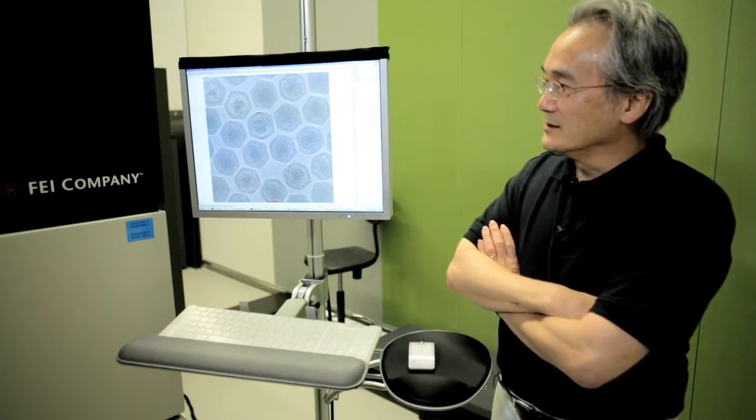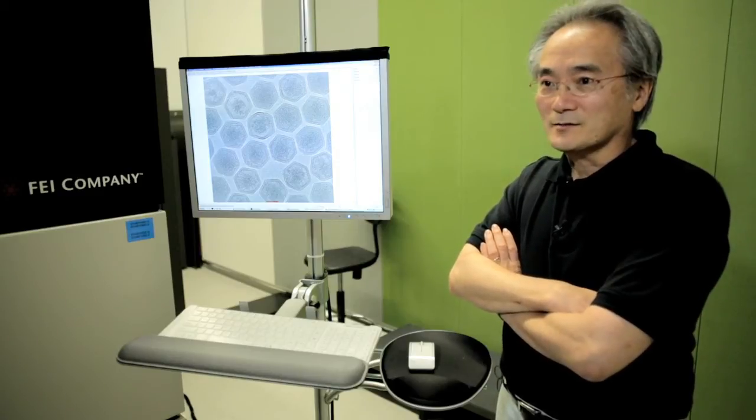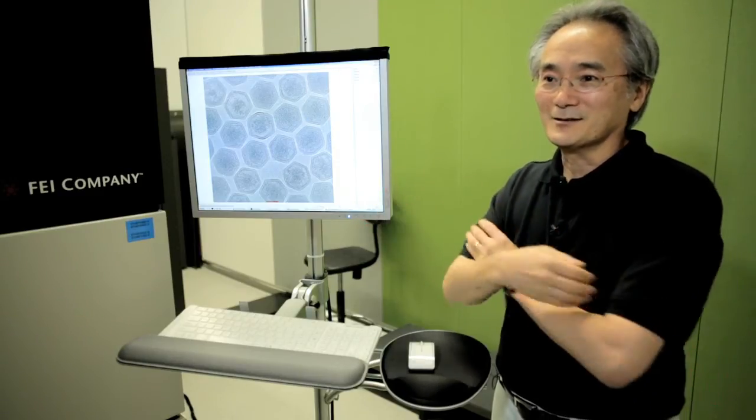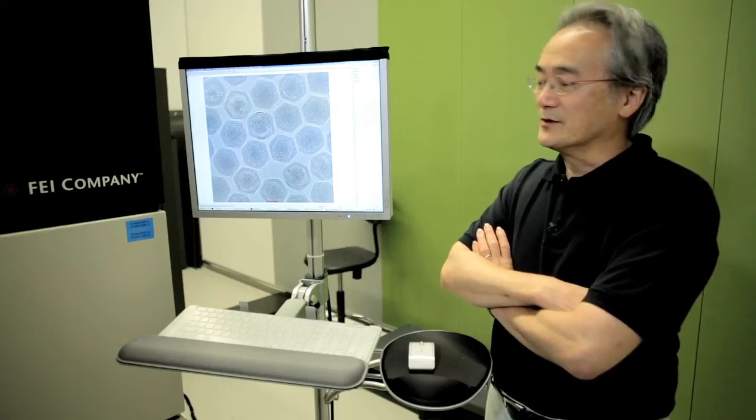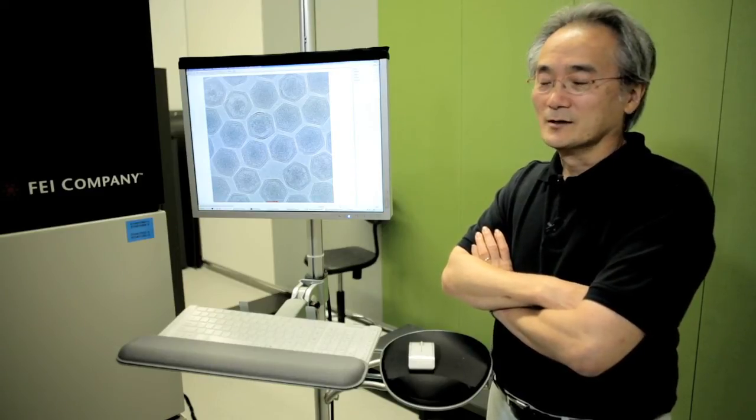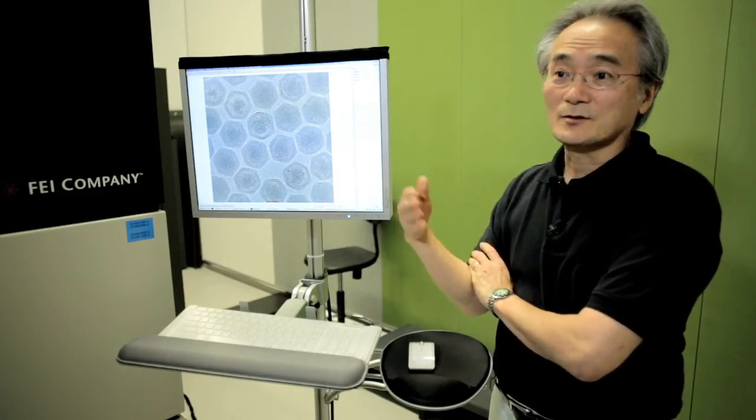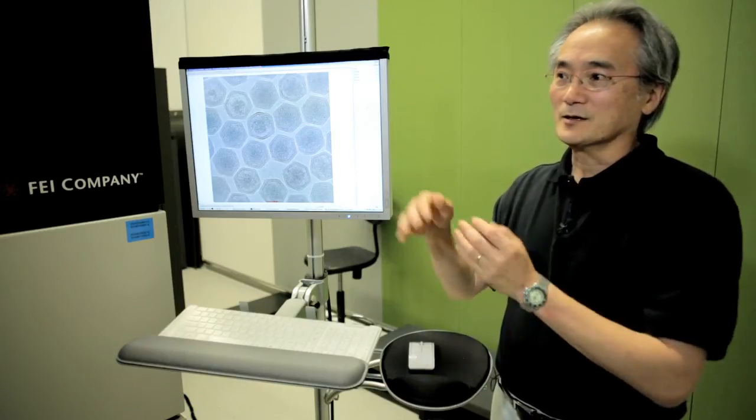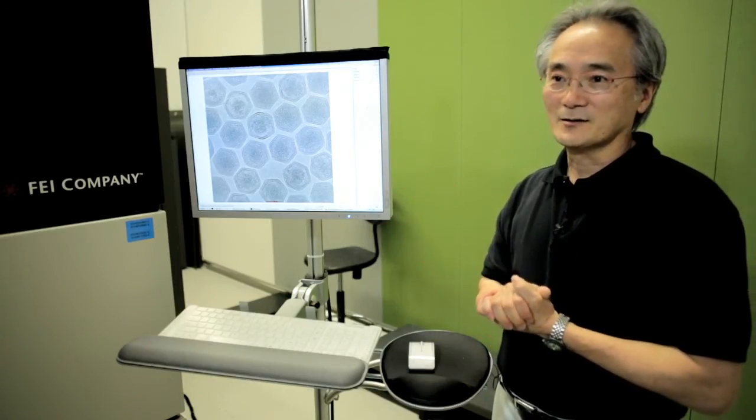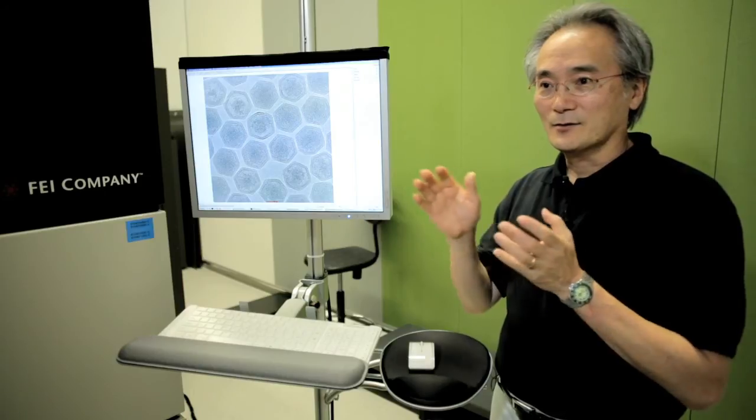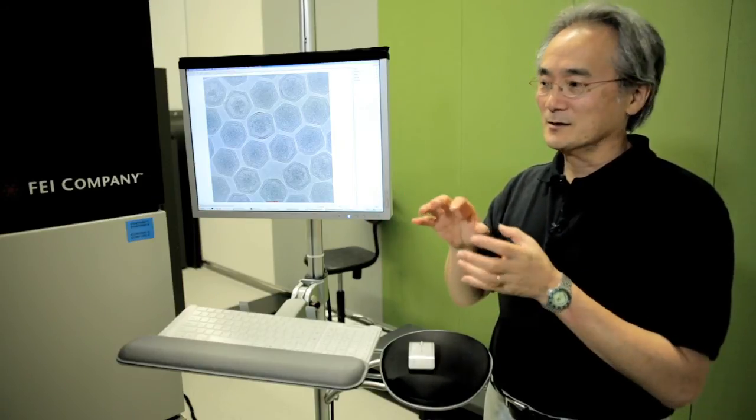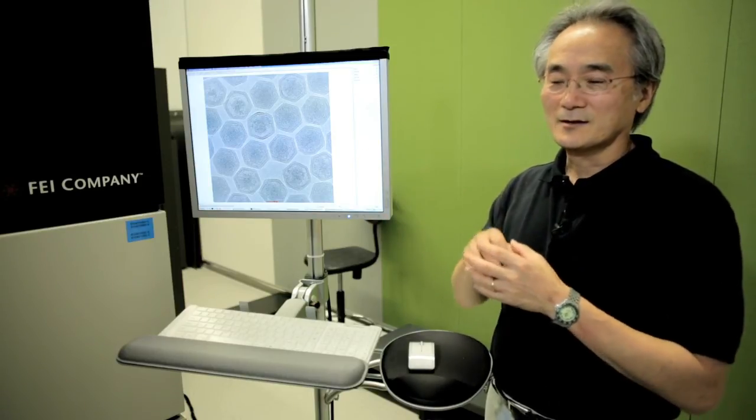As you can see here, the picture of the virus, the virus is frozen in water. So obviously it can't do anything. It doesn't move. But we've developed methods here in Singapore in which we can put viruses or other structures in water and preserve it in the vacuum of the electron microscope. Hopefully now we'll be able to watch a virus such as this do its thing.